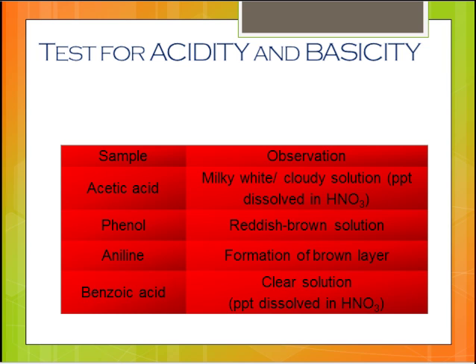Here we see the results. No reaction with phenol and aniline, other than slightly messing up the appearances, that is, and with acetic acid and benzoic acid, it tested positive for acidity. Well, who would have figured that out? Wasn't quite obvious with the name, was it? Formation of precipitates occurred and addition of nitric acid dissolved it away.